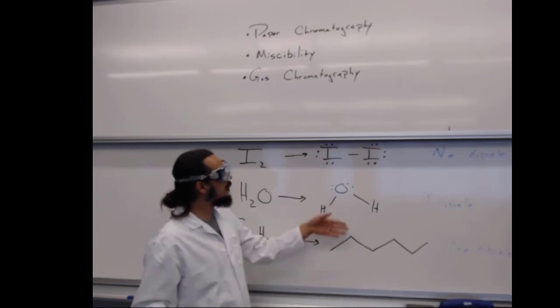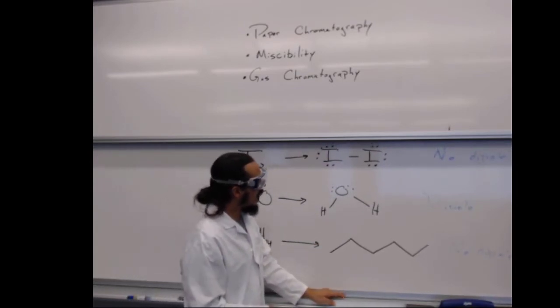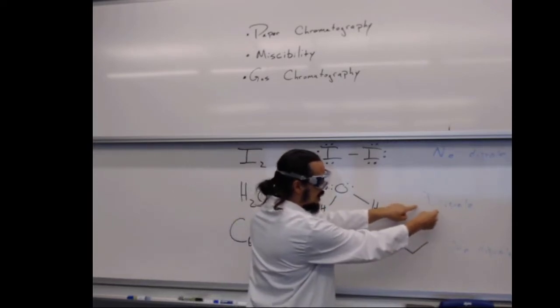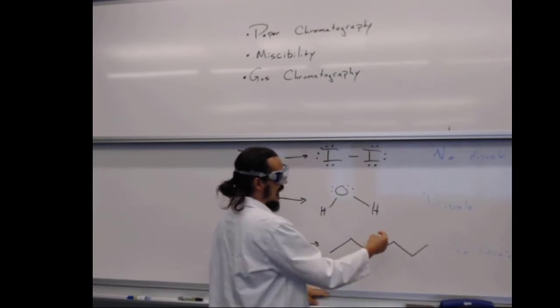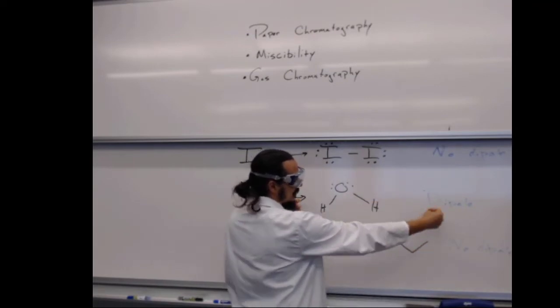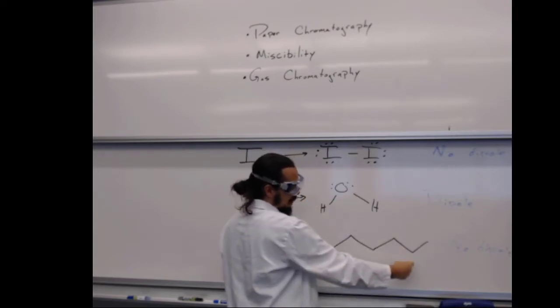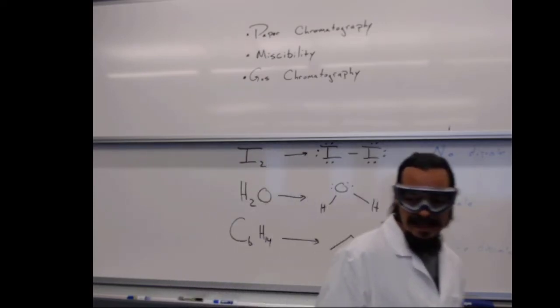But on this first pass, in considering the intermolecular forces, I would think if we just had water and iodine, the water, because of its dipole moment, would keep interacting with the water. And if we had water and hexane, these two things wouldn't mix because the dipole moment of the water would have an energetic benefit of interacting with itself rather than being forced to interact with something else. Let's take a look at that.